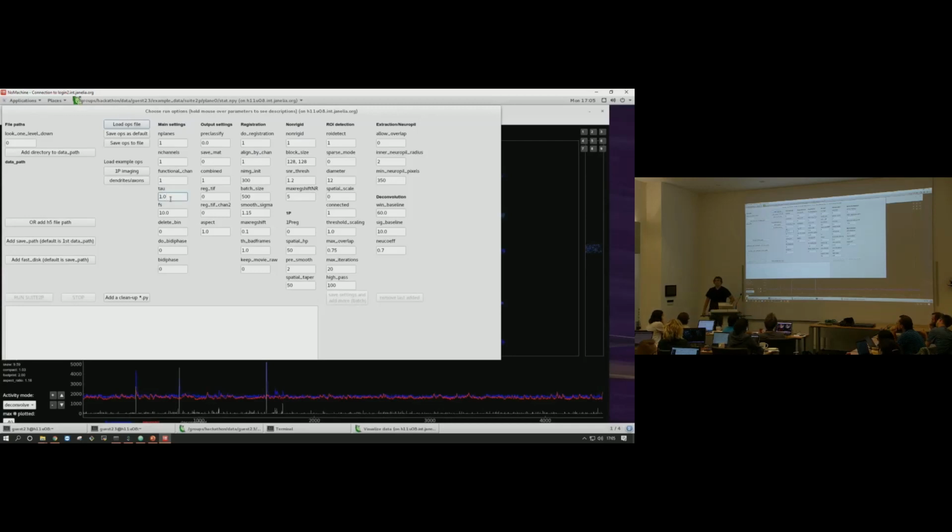It's actually used in one other place: to make the cell detection run faster, we bin the movie according to the time scale. If consecutive frames are basically correlated because of this long time scale of GCaMP, they're not really independent new samples of the data. So binning them, we're not really going to lose a lot of the signal to noise ratio for the cell detection, and it helps us a lot in the speed of that.